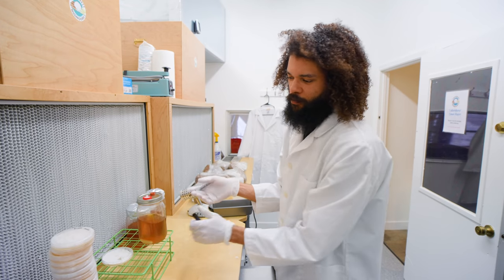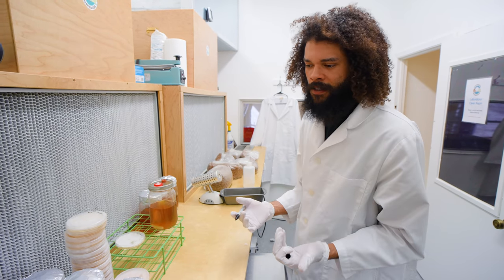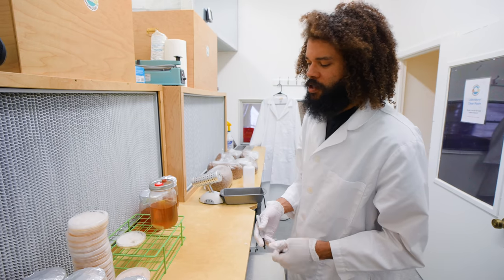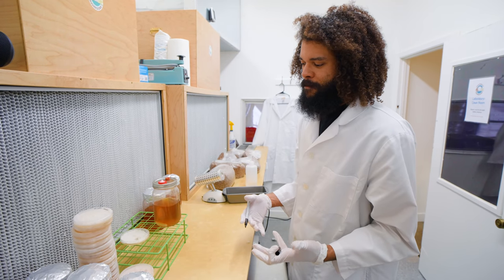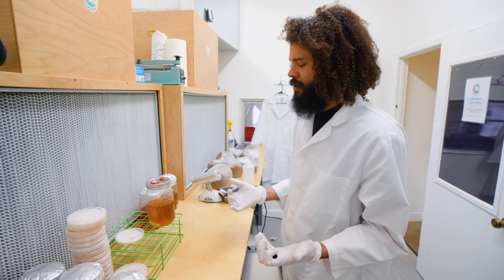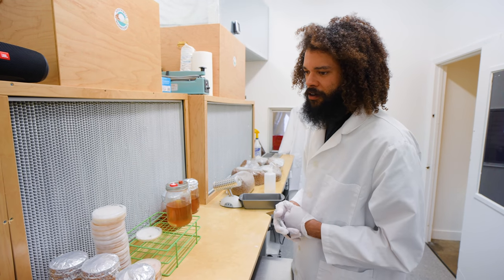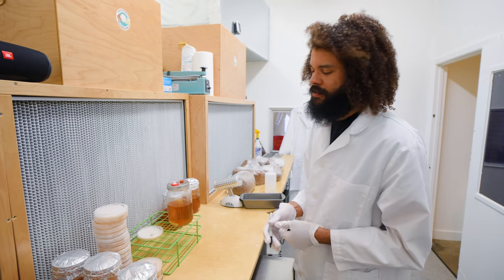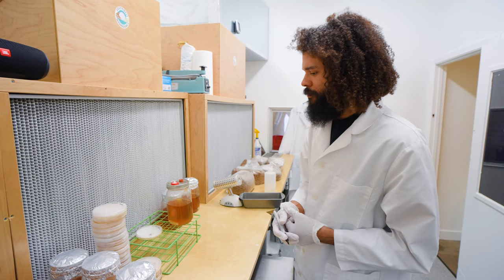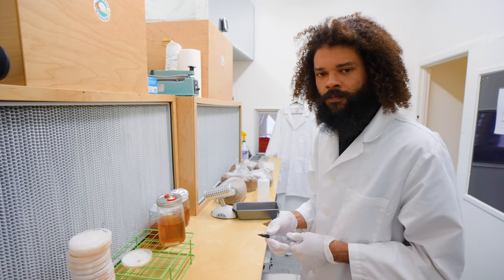Making your own cultures, growing out grain spawn, and producing mycelium in culture form is the most important part of your mushroom growing process. This is going to be the future of your growing — as far as what production you can do, this is the life of whatever you're doing, whether you're producing for food, medicine, or for clients. It's super important to not cut corners.